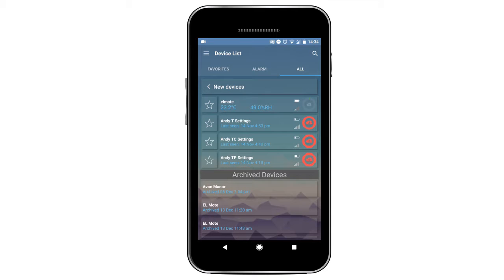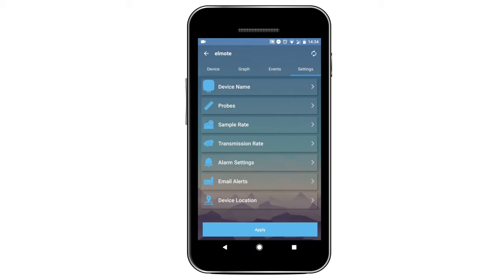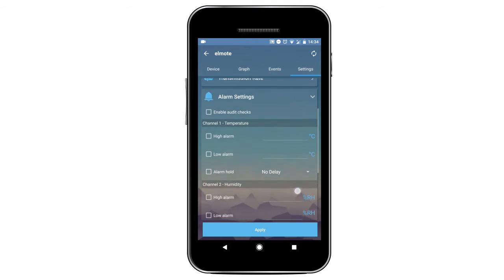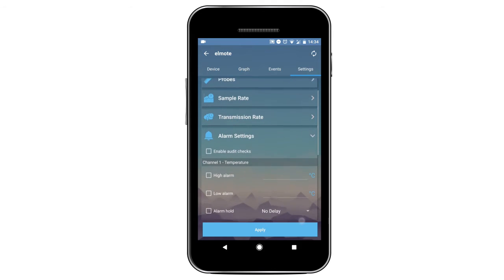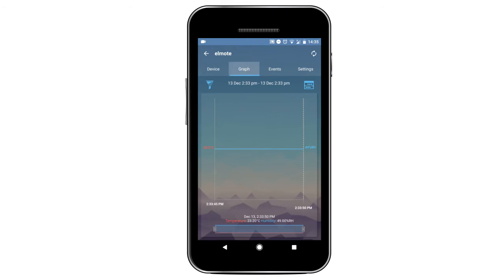Go to View Devices and then All to see your newly set up data logger. To read data from your logger or change device settings including alarms, sample rate and transmission period, tap on your device name and select your desired tab. You can then flick through the tabs to view your data on resizable graphs and add notes to each logged event.